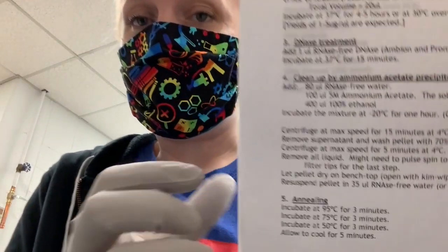Okay, so at this point in our protocol, my double-stranded RNA has been incubating for over an hour. And the next few steps will be to centrifuge that precipitated double-stranded RNA as per the protocol, to pull that material down to the bottom of the tube and wash it off and then resuspend it in water. So the first thing we're going to do is to spin our samples. So we'll come and get them out of the freezer.